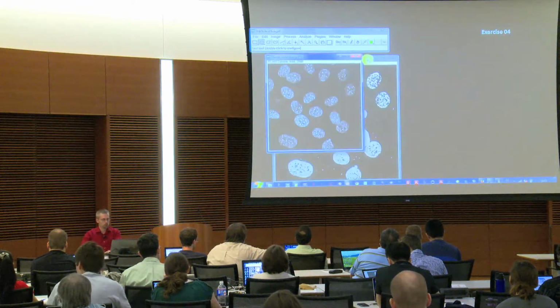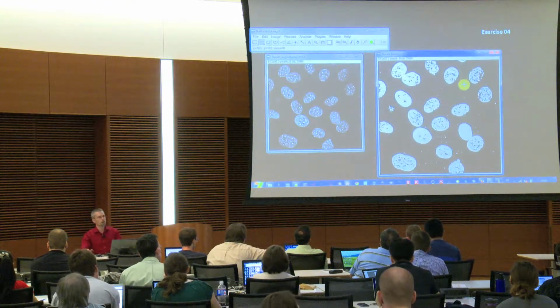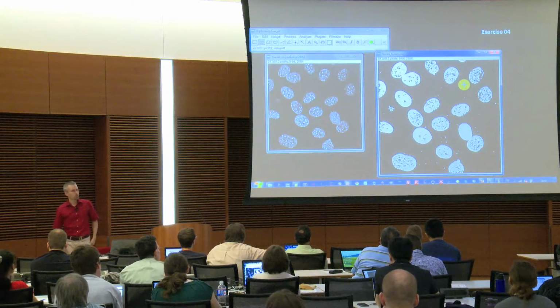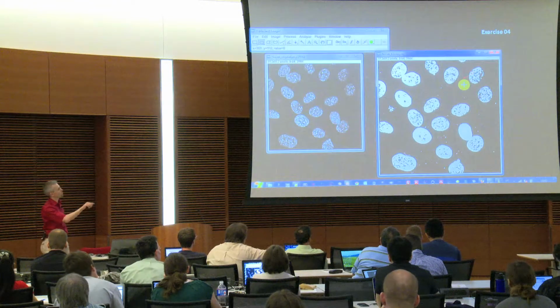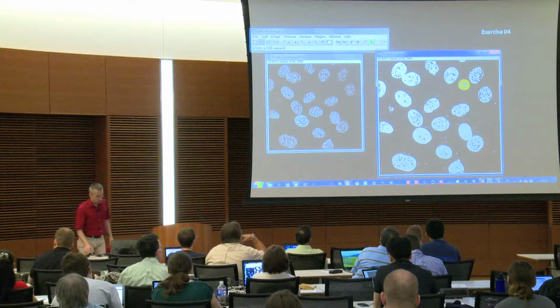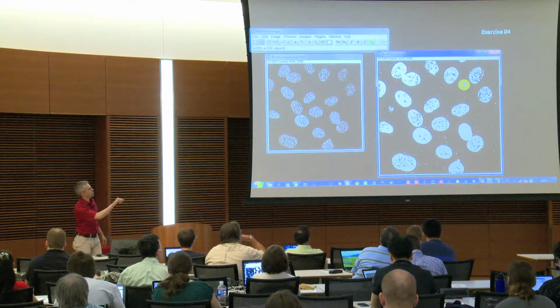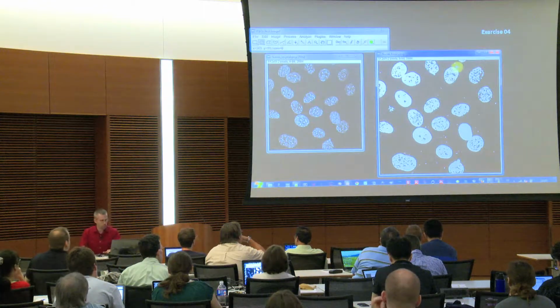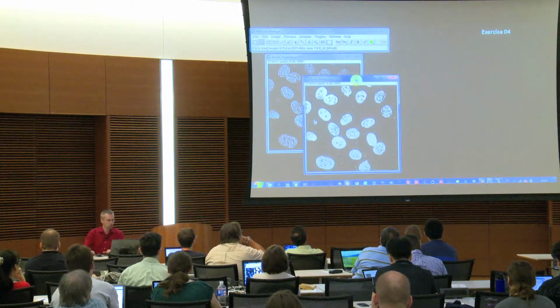Original, just to show you how the original looked and the binary after the extraction. A suboptimal extraction, obviously, with holes; we have those features not complete. So, different possibilities. First of all, I have connections here. Now, if I directly want to try to separate those connections, that will go very wrong.